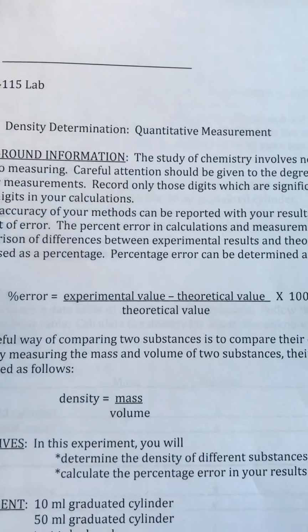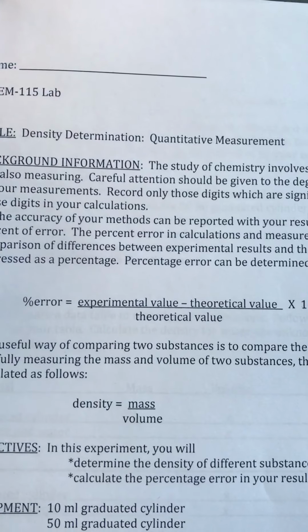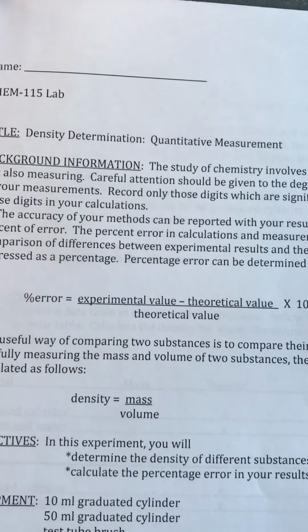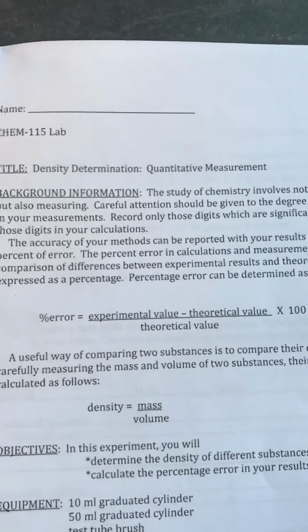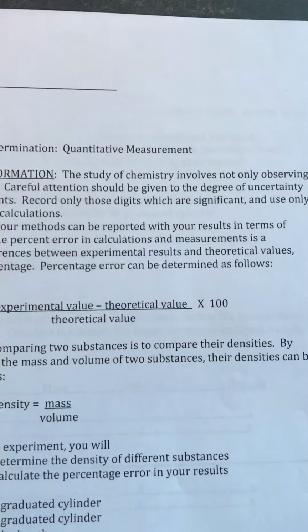So you're not going to get a negative percent. Whatever you get for the answer, if it comes out negative, because you subtract numbers sometimes and they come out negative, just ignore it. It's an absolute value. So get your percent error, and hopefully my measurements weren't too far off. But we'll get something under 10%.